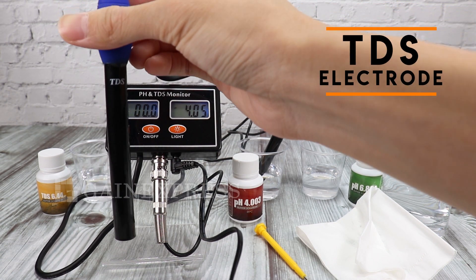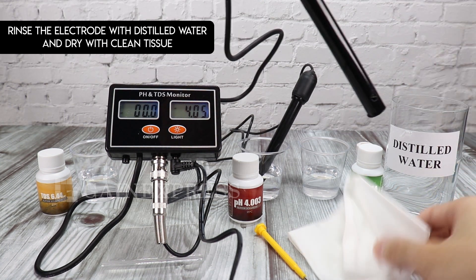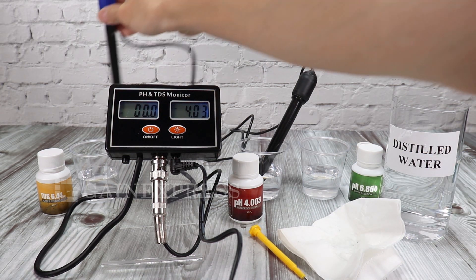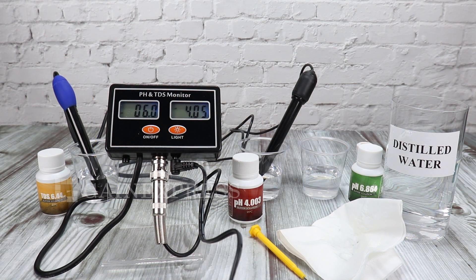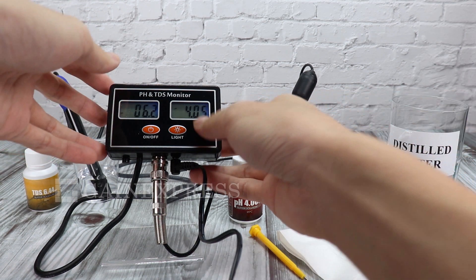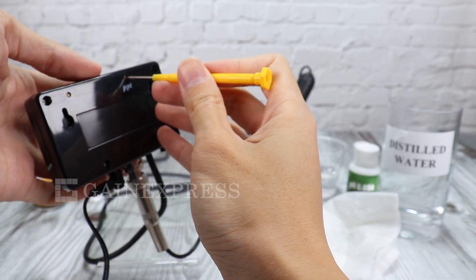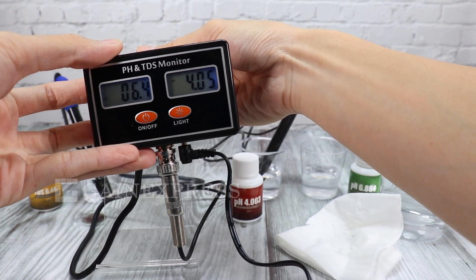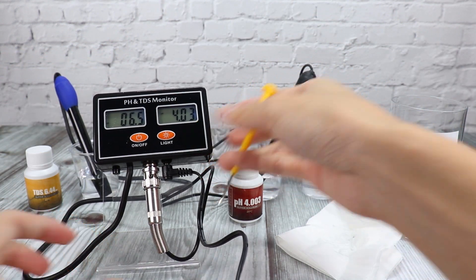For the TDS electrode, immerse it into the TDS 6.44 solution. Slowly turn the TDS calibration trimmer until the display shows 6.44. Again, if the display value is within the error range, it is acceptable.